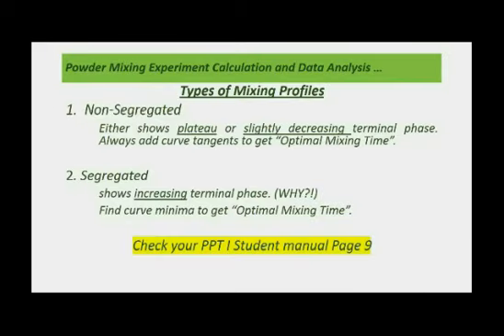Remember that types of mixing profiles are non-segregated and segregated. Non-segregated mixing profiles will show either plateau or slightly decreasing terminal phase.